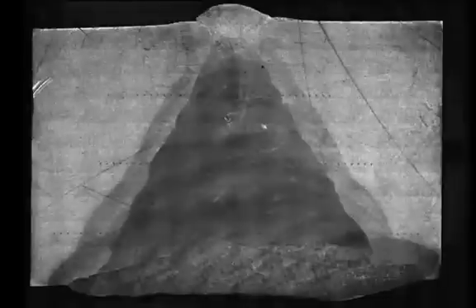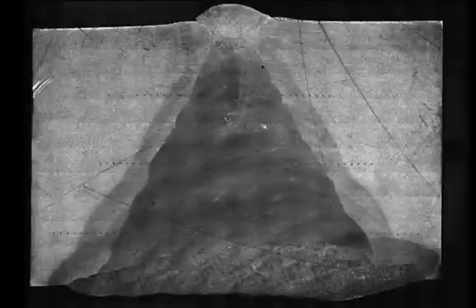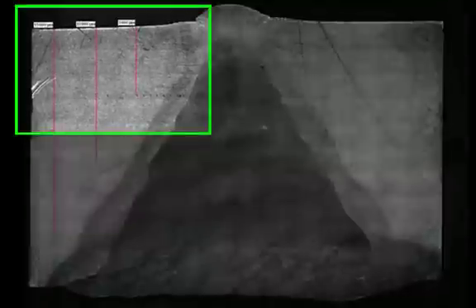In this large weld, test patterns were set up at specific depths with accurately calculated start and end points.